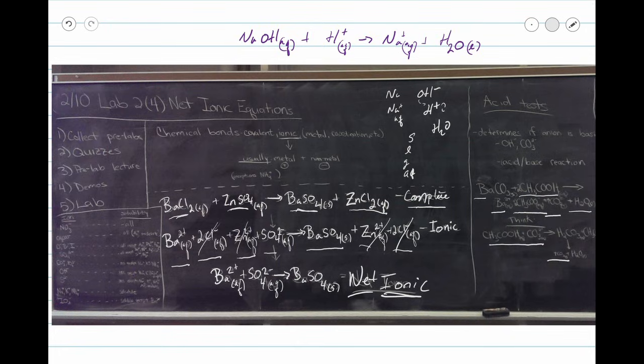This experiment has 2 parts. We're going to test 6 known ionic compounds that are dissolved in water. They are zinc nitrate, sodium iodate, sodium chloride, sodium carbonate, barium chloride, and aluminum sulfate. We're then going to test 6 unknown samples. They're actually all the same compounds as in part 1, but they're labeled 1 to 6, and it's our job to identify each solution by comparing our observations from part 1. Finally, based on your observations, you will write the chemical equations for the reactions you observed.